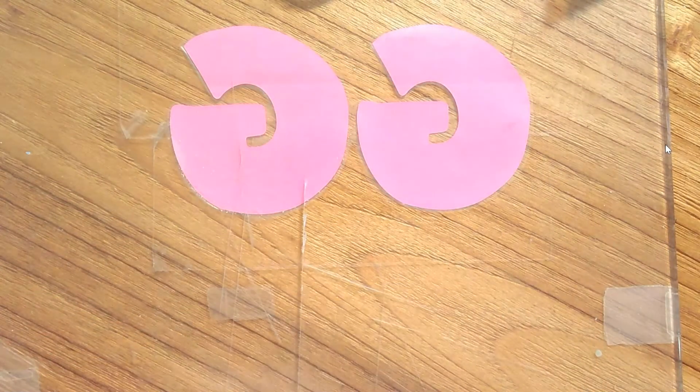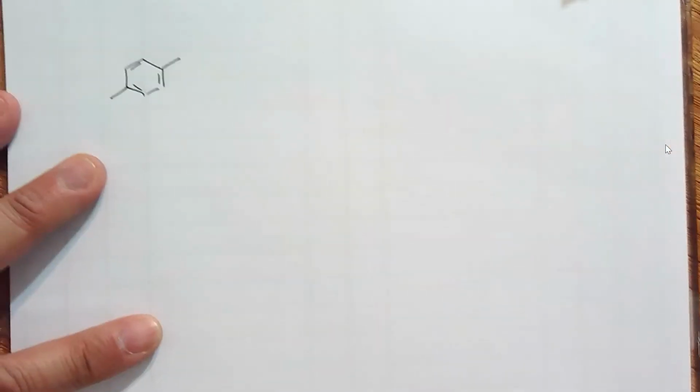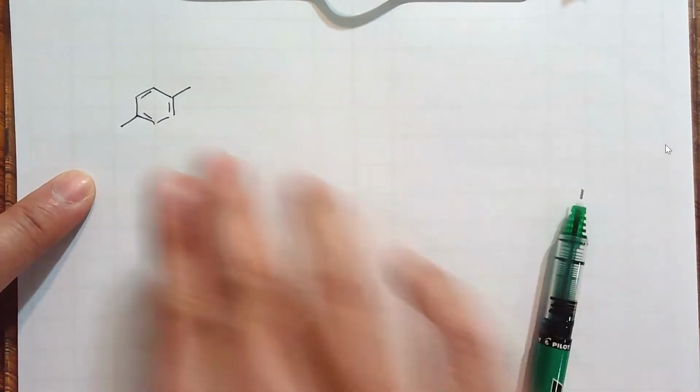Let me get to a couple of things about the actual NMR spectrum. Let's take this molecule here and apply some of what we've talked about. Number of signals. Well, this is symmetrical.